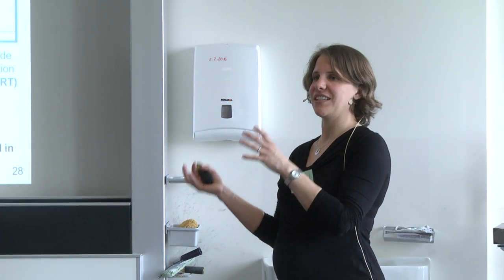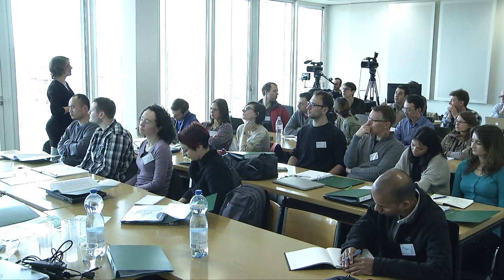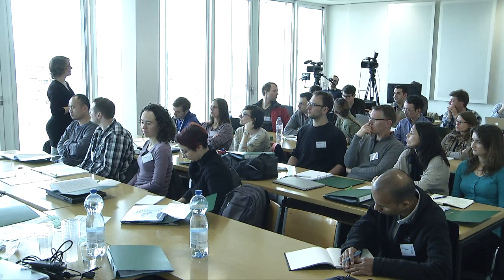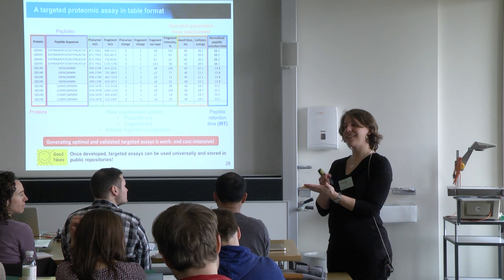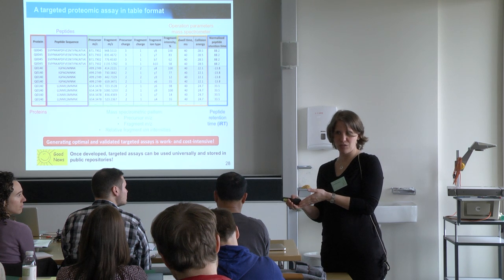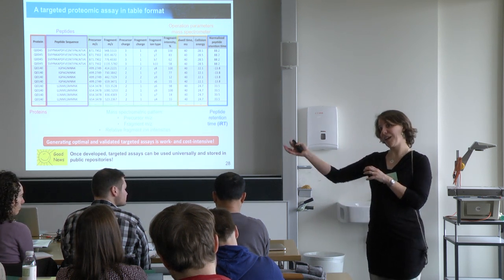Different fragmentation mode in discovery will have a huge impact on the intensity. The only reason I'm saying that is because when I'm looking at triply and doubly charged, fragmentation may be completely different. So I may have precursors which are really high in triply charged, but the fragmentation looks completely different to what I'm going to see on the Xevo. And you're right, and there is no way to actually predict this. Exactly. The way to solve this is to make your assays on the instrument where you do the SRM measurement. So this is why people often do this SRM triggered MS2, where you're on the triple quad generating. Then you get the best match or consistency in these things. And it's something you need to be aware of when you come from another instrument.